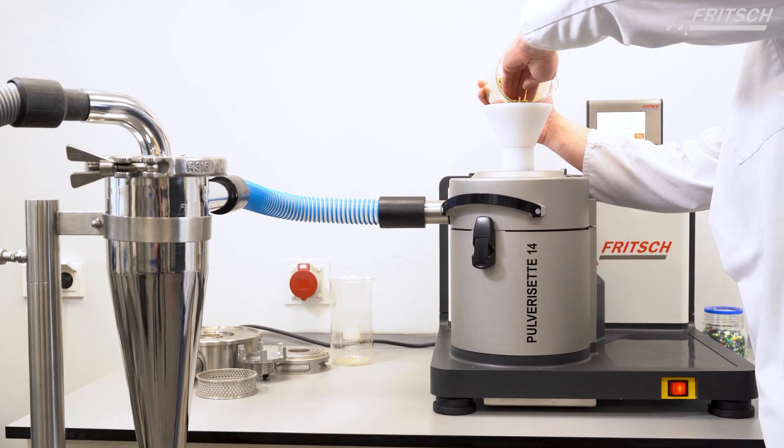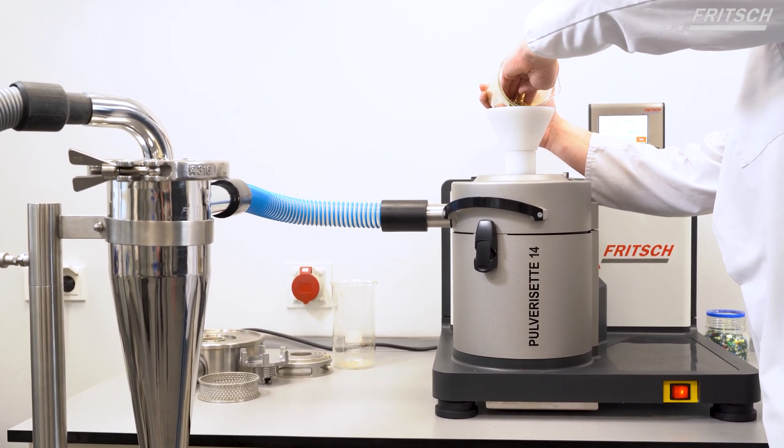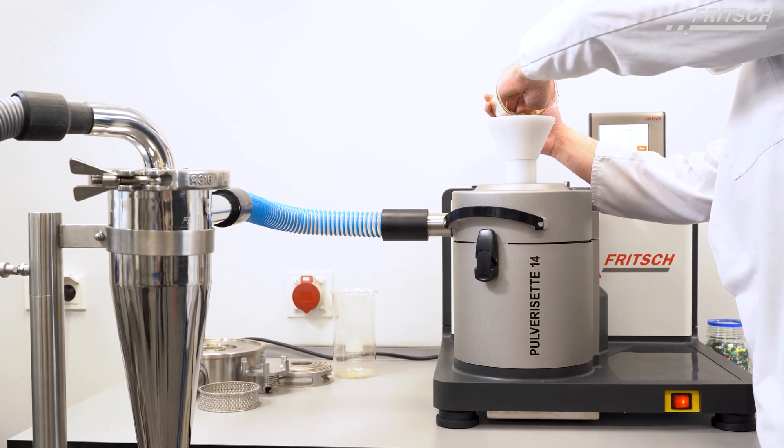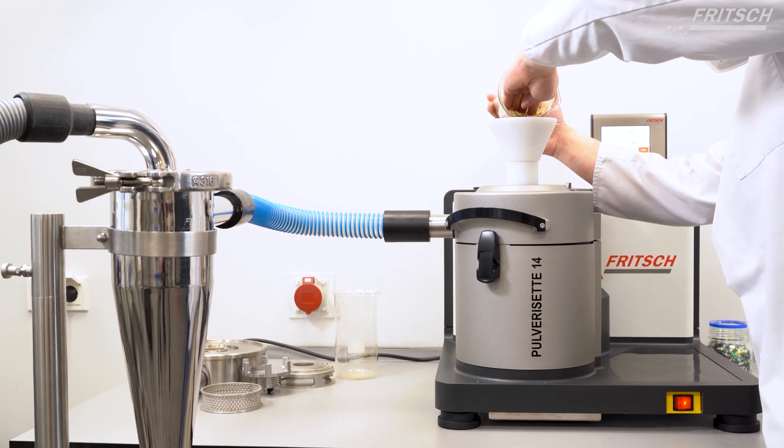In addition, it can be completely dismantled, fully emptied, flooded, and sterilized. Your advantage? Reliable protection against cross-contamination.